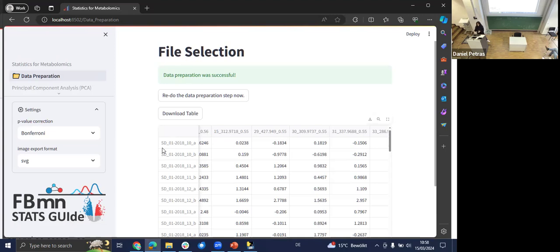In order to not disturb by removing this feature ID, I did not annotate metabolites in the files that I generated. That is what you would find in the FBMN stats folder, so that you can nicely separate this information, take these unique IDs, and again go into Cytoscape, put it all together with the significant features and network visualization as well.